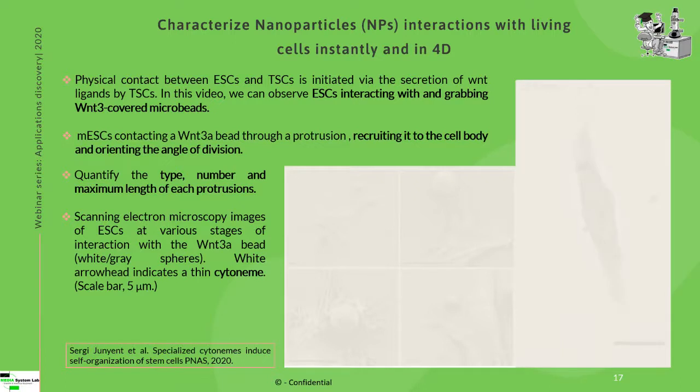And on the same images, it's very evident how this cytoskeletal component is going to interact with the microparticles. So while scanning electron microscopy can give you the resolution, allowing you to go into detail and see the components of the cell in action, on the right, the holotomography can give you the live vision of this and also confirm that the interaction was real.